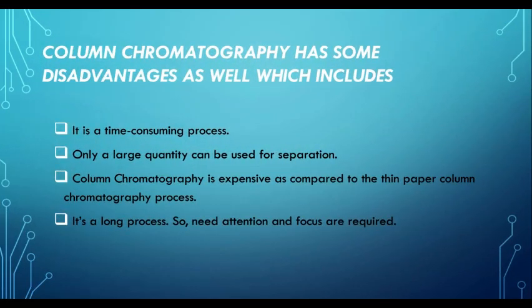Disadvantages. Time consuming, only a large quantity can be used for separation. Column chromatography is expensive as compared to thin layer or paper chromatography processes. It's a long process, so it needs attention and focus.